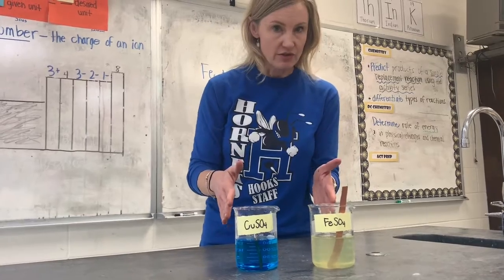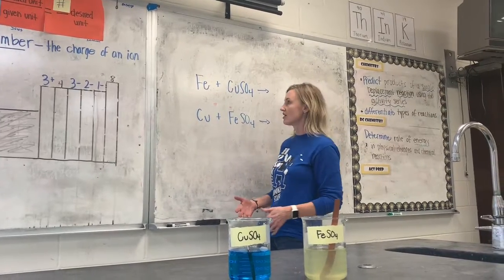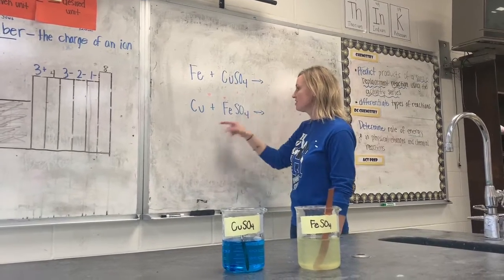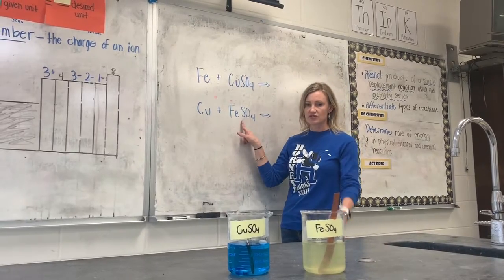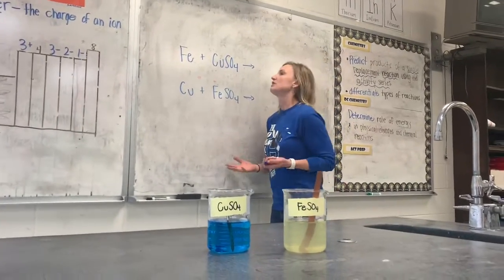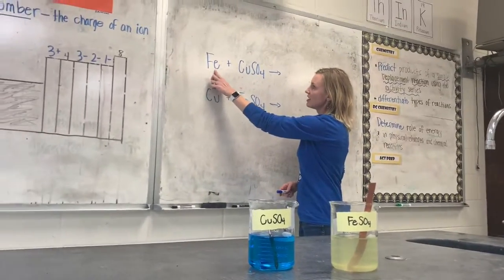And so now what we're going to see is iron in copper sulfate, and copper in iron sulfate. While we let that sit for a little while, if you'll look over here, I've written out what these reactions would be, so our reactants and our products. You've got the iron nail in the copper sulfate, the blue solution. And then you have the piece of copper in the iron sulfate, which is that pale yellow solution.